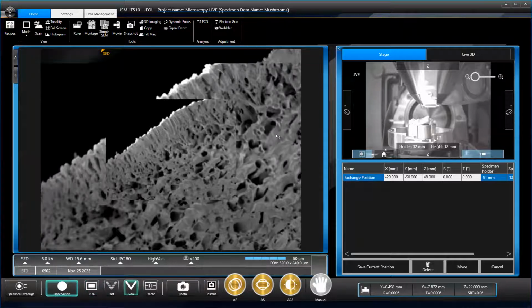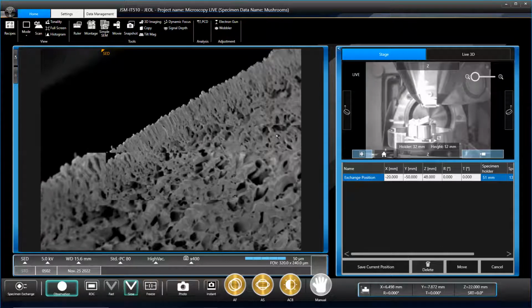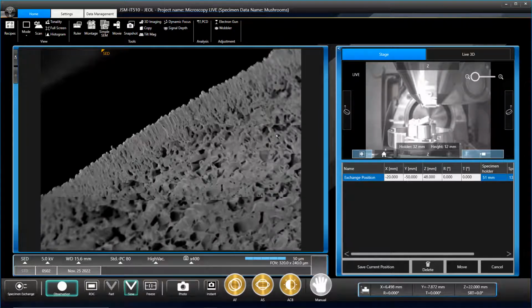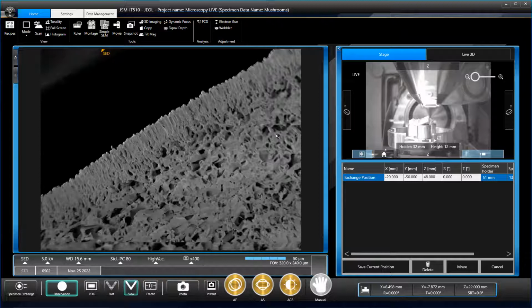So when they're ready and conditions are optimal, so humid and a bit cooler, you start to get these mycelia that will form primordia, which are these denser clumps of the mycelia. These then fruit above ground, and that's what produces the mushroom. Yeah. So if we get to look at the mushroom caps, that will show us the dense mycelia that are producing their mushrooms. Oh, cool. Yeah.